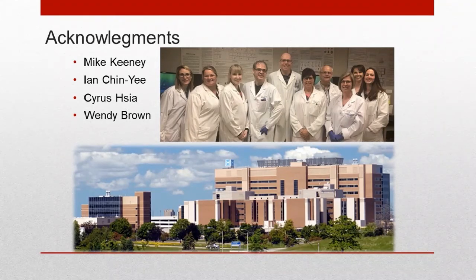The more cells that you count, the lower the limit of detection would go, but this is not intended to be more than a diagnostic panel, so it's not intended to do residual disease type assessments. That's why it was set up the way that it was. It wasn't arbitrarily established; it was determined experimentally from the number of events that you can possibly collect within a small space that would be clonal and indicative of disease. It wasn't just arbitrarily decided, no, it was calculated.